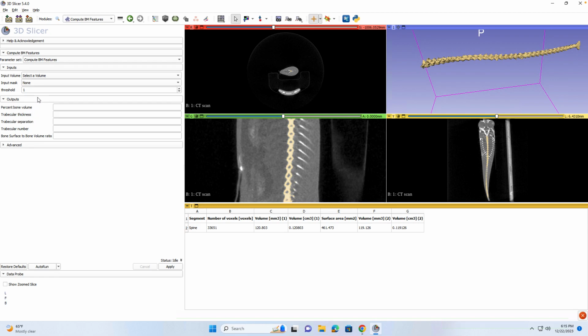The big thing here is that we just created that volume. So we're going to select it, segmentation, spine, label, as the input mask. And the big thing is making sure that the threshold is at 1. I've tried 0.5, but it doesn't work. I've tried 2 or 1.5, and that doesn't work.